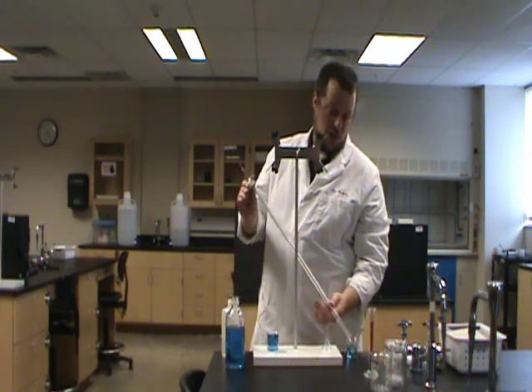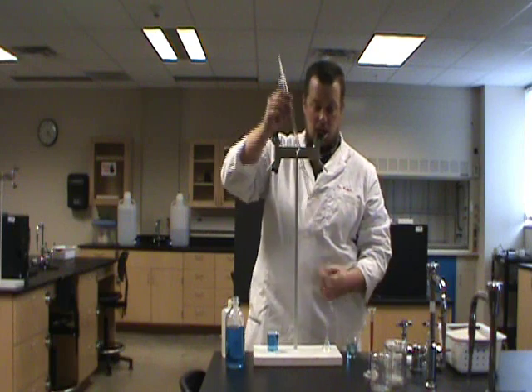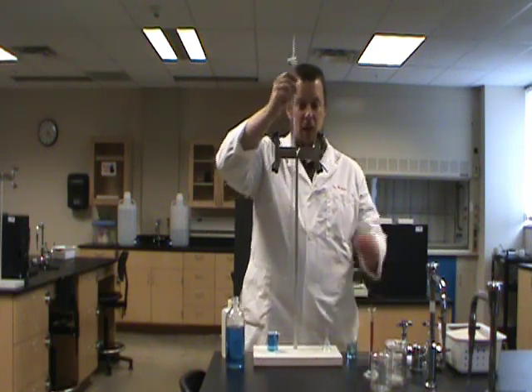So I usually get impatient, close the stopcock, tip it over, open the stopcock, and now I've got a burette draining. Depending on what you're doing, sometimes it's nice to just hang them back in the rack upside down so that they can drip dry and wait for the next class.